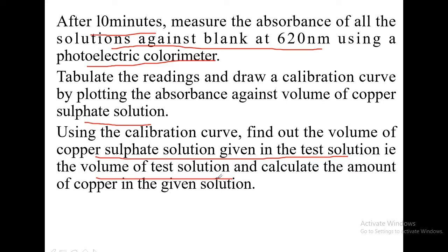So after doing the experiment we have to find out what is the volume of the test solution, and once you know the volume of the test solution you can calculate the amount of copper in the given solution. So what amount of copper is present in the given test solution, that is copper sulphate solution, that we can do by simple calculations.